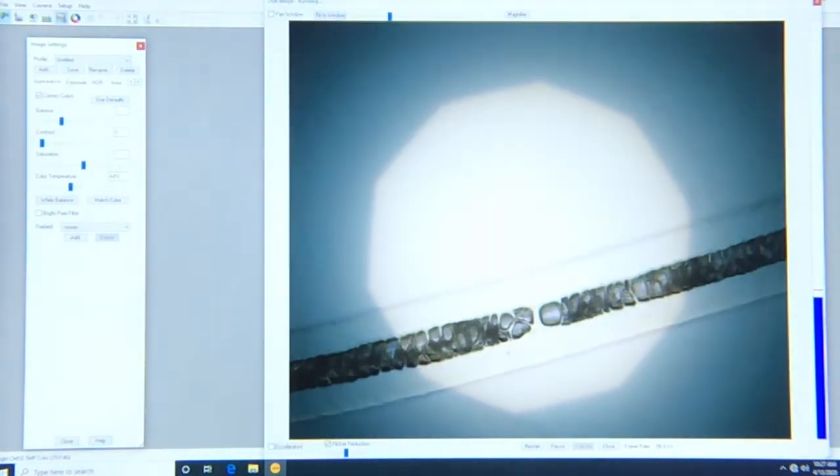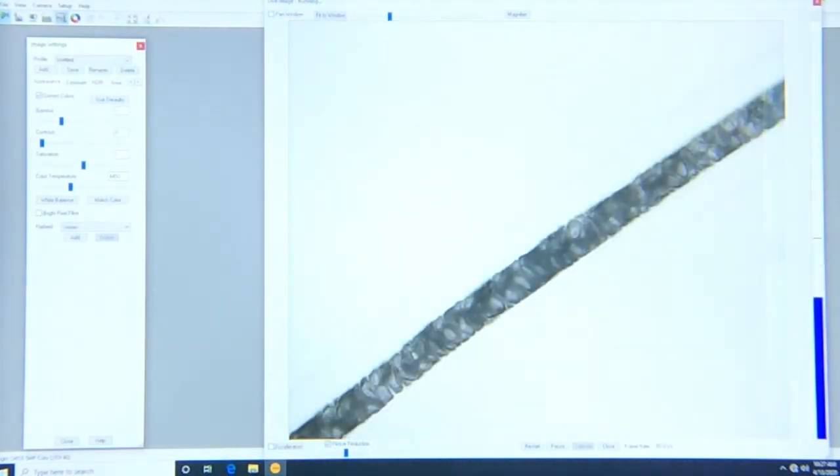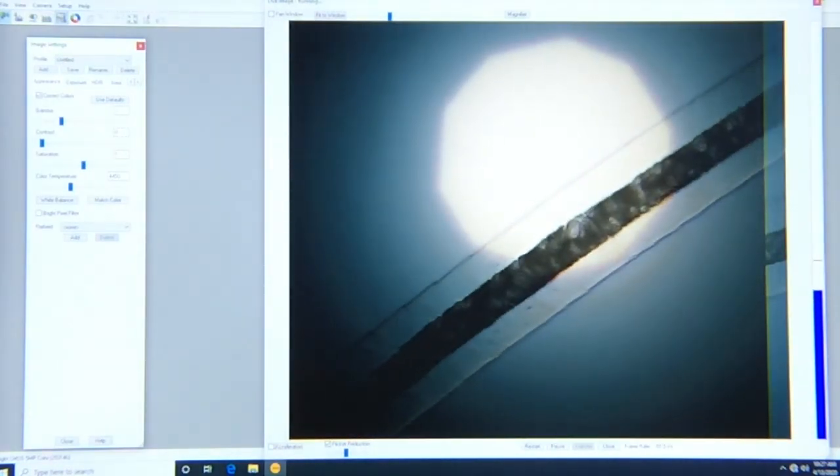Going to open that up a little bit, and now we're going to switch to the left-hand microscope. And we're going to do the same thing here. We're going to close down that field diaphragm. And we're going to use our condenser focus to make it nice and sharp. And then we're going to center that one as well.